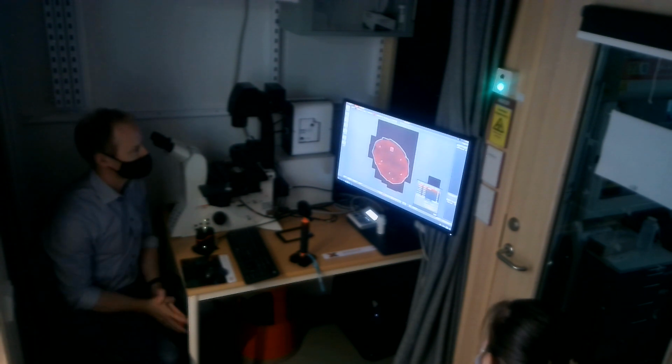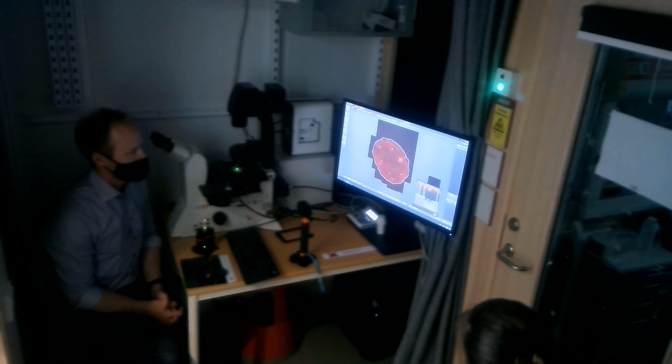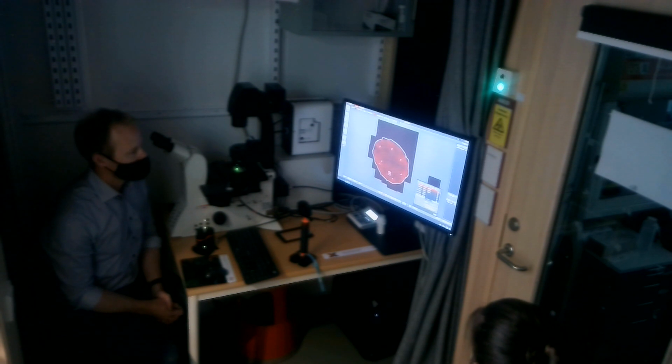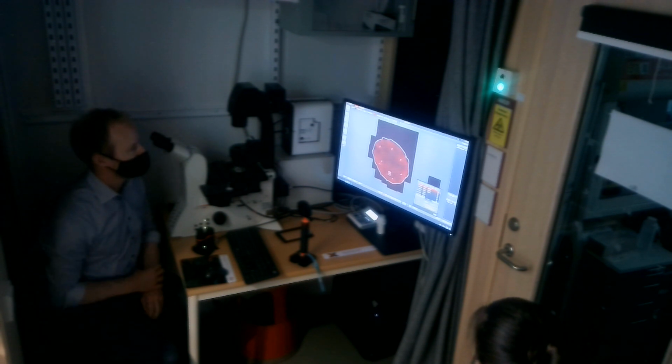Alright, how does it seem? Straightforward? Good. Yes. Very good. We're getting to the point where I'm gonna hand it over to you to try to do a little bit of imaging.